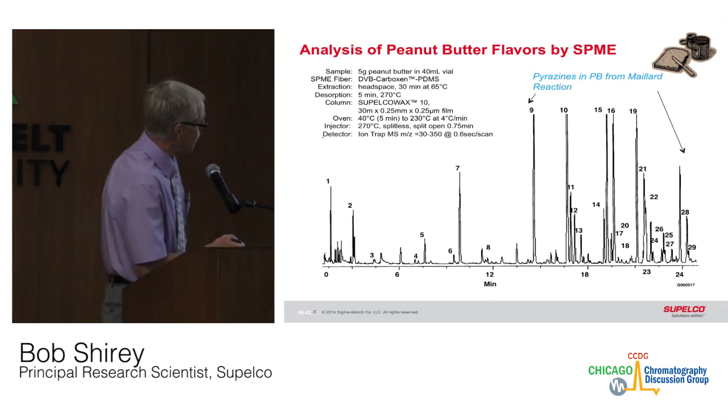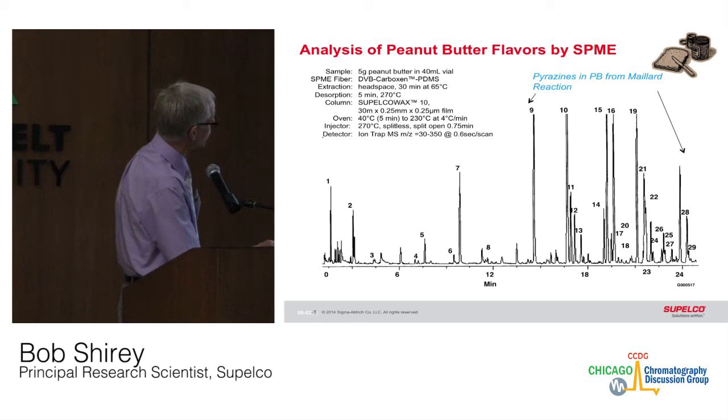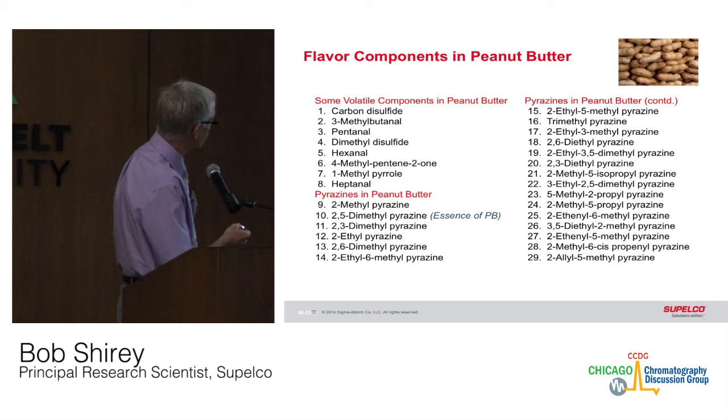The analysis of peanut butter. This is another one where the Maillard reaction and the formation of pyrazines, primarily from 9 on out. And we also see some of the off-flavor components here in the beginning: carbon disulfide, the aldehydes and sulfur components, because peanut butter does have a lot of oil in it. And then we look at the pyrazines, which are the flavoring compounds from the roasting.